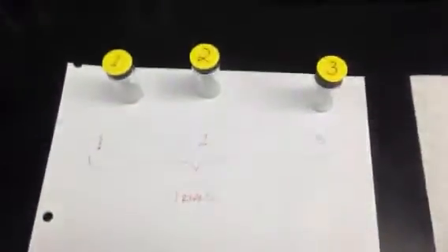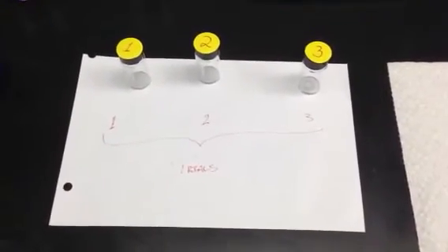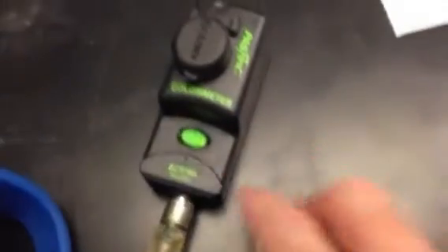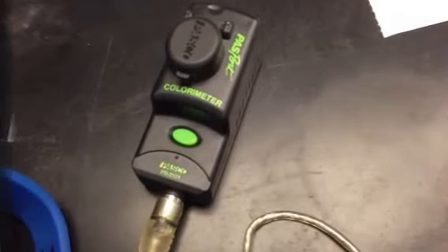I would strongly encourage you to label your cuvettes with dots on top. I have a blank that I'm going to put the water in, and then I have the three trials — one, two, and three — so there's less chance of mixing them up. To run the blank, open your colorimeter, take the blank cuvette, set it inside the chamber, close it, and press the green button. It's going to light up, and once it has completed running the blank, the light will go off.